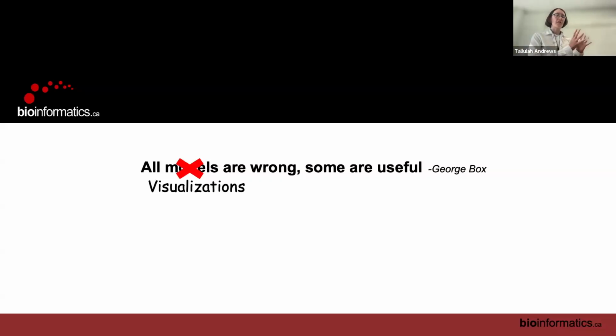Whereas one of the nice aspects of PCA is that the distances between points are preserved in PCA. So if 2 points are close together in a PCA plot, they're actually close together in the real gene expression space. We're going to see with our visualization methods that that's no longer necessarily true, because the goal of our visualization method is to show as much of the structure of our data set at once in 2 dimensions so that we can make a plot to put in our paper. It's not to preserve the fidelity of our data to the real gene expression space.